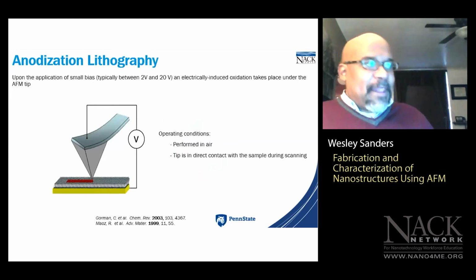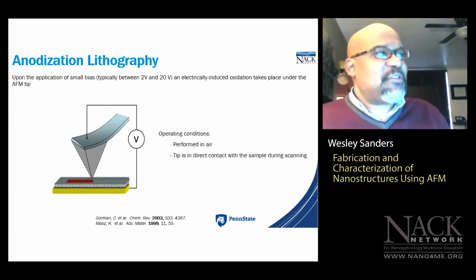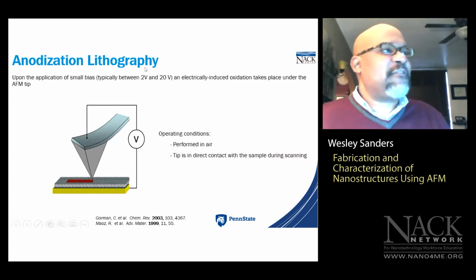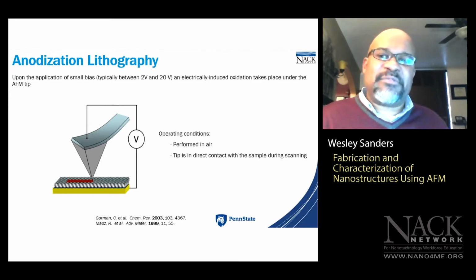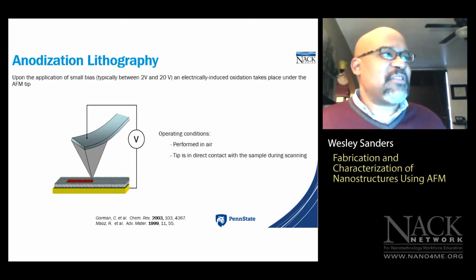So the last type of lithography I want to discuss with you before we get into our specialized AFM imaging modes and then Glen's demonstration is anodization lithography, okay? Now, anodization lithography is somewhat similar to electrochemical DPN, okay? So there are some key differences between the two.